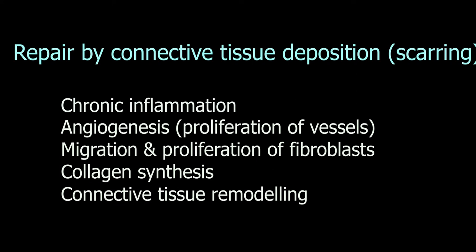Those elongate cells lay down collagen fibers, and eventually all of those cells die or move out of the area, and you're left at the conclusion with just scar tissue, made up of fibrous, collagenous, hyaline-appearing tissue that's pink and doesn't have many cells or blood vessels present in it.